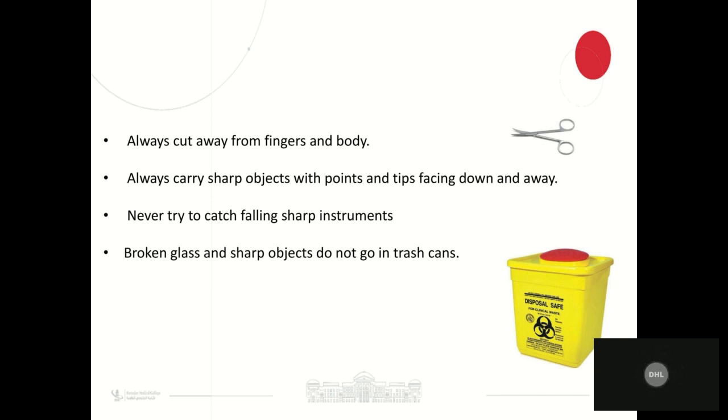When you use the scissors, cut away from your fingers or body. And when you carry any of these sharp objects, point them facing down, and never try to catch falling sharp objects. And if you have any broken glass or sharp objects, put them in the yellow bin.